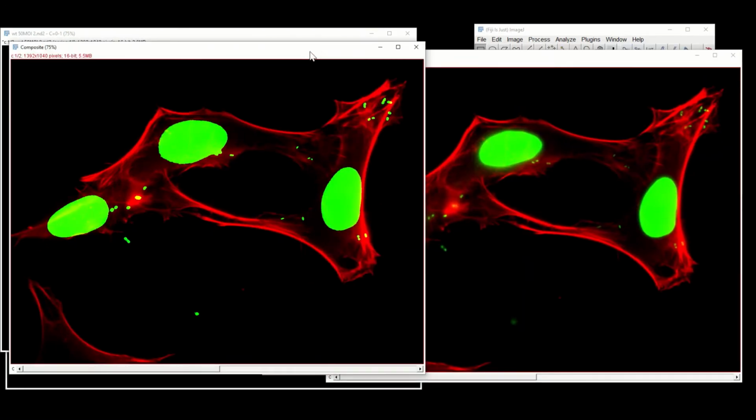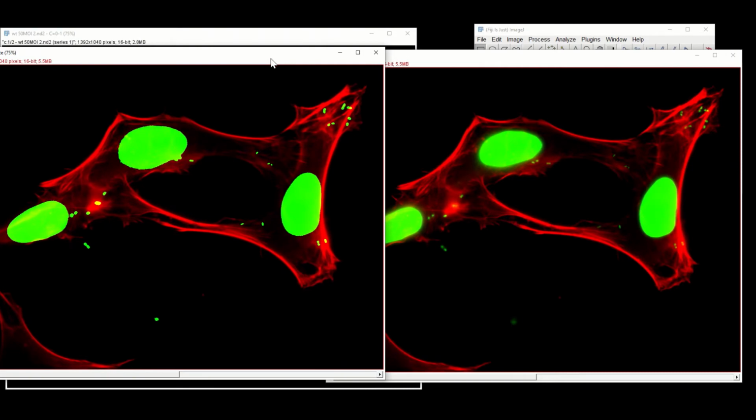So what can you tell when you compare this image to this image? Well, right away you can see that this is not a true image. Of course, this is heavily modified, and we have to acknowledge that. This, of course, is also heavily modified, but not as heavily as this one. However, if you're only concerned about seeing where you have those little tiny bacteria, this is quite useful because it's very easy to see where the bacteria are. For example, here it's very difficult to see this little bacteria over here, but this kind of analysis makes it much easier to see this.